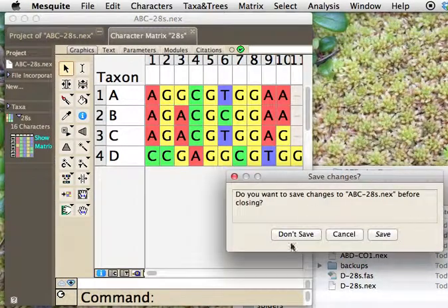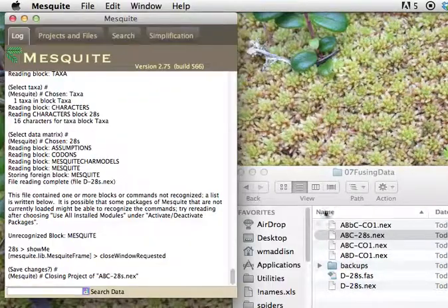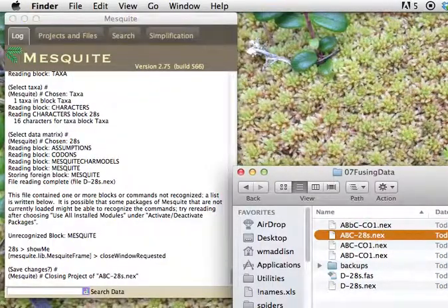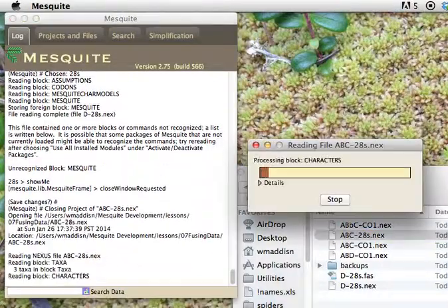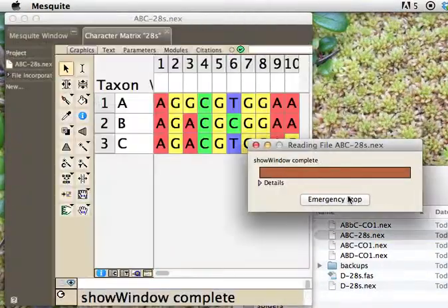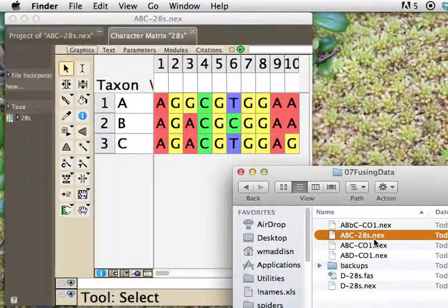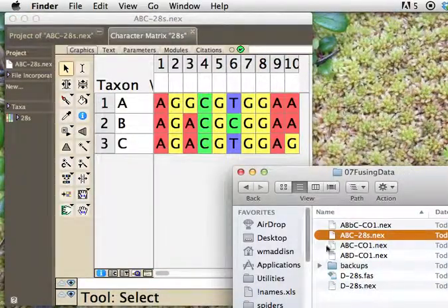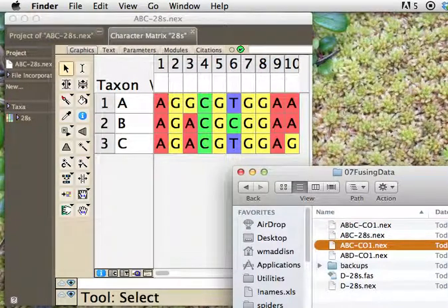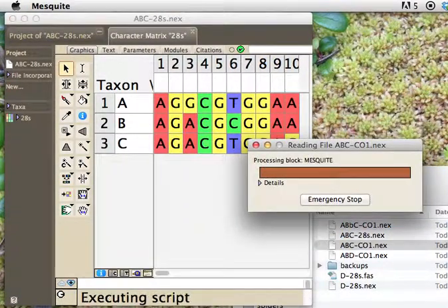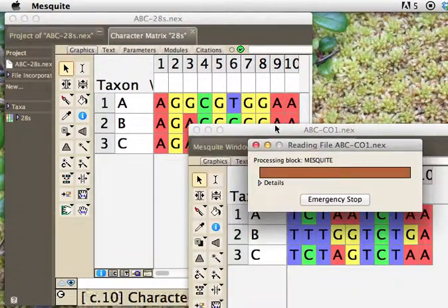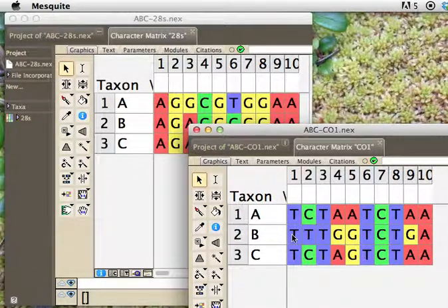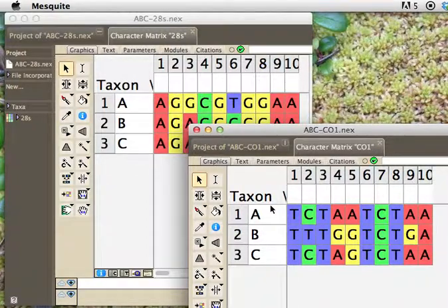But now I'm going to give you a puzzle, which is what if what we want to do is not add to an existing matrix, but we want to add a new matrix to this set of taxa. So we've actually got now A, B, and C have, instead of 28S sequences, they have CO1 sequences, and here are the two files.